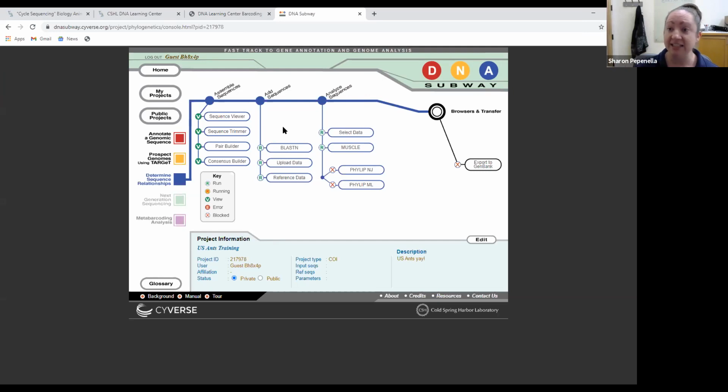Now, in the past, the sequence data that you found on the Barcode of Life database and the sequences that you found on GenBank were somewhat mutually exclusive from each other. But recently, I've seen that GenBank will start to import sequence data from BOLD, and BOLD will import sequence data from GenBank. So you don't have to do a lot of comparisons or checking of your DNA sequence across multiple databases now. Most of this data can be found in GenBank.